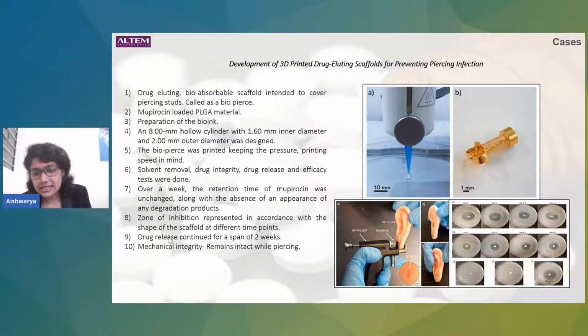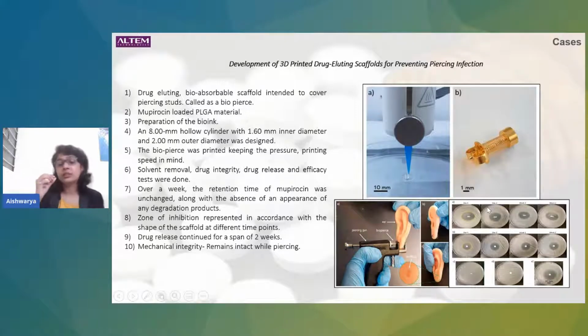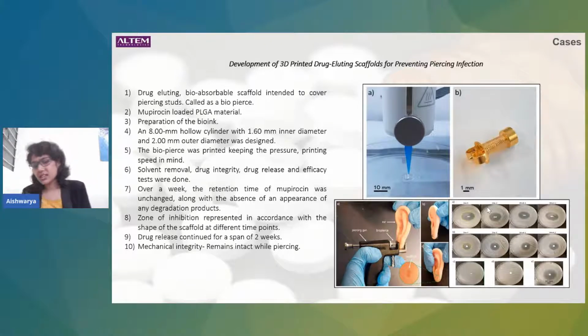You check obviously through your scaffold tests, where, for example, in this case, they take a microbial culture and they put down the scaffold. The scaffolds are obviously created in various sections. I mean, you always have a test and you have the main drug which you're trying to test. So when you have your test drug versus your main drug, you would also see something called a zone of inhibition. Whenever you have any microbial study, you would try to place that drug at that site, and then you see what is the zone of inhibition.